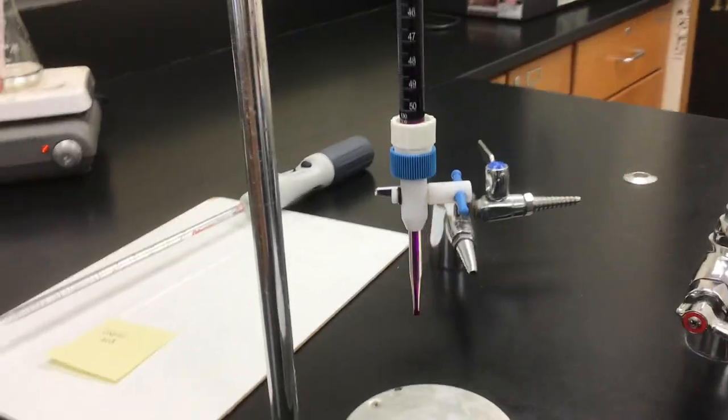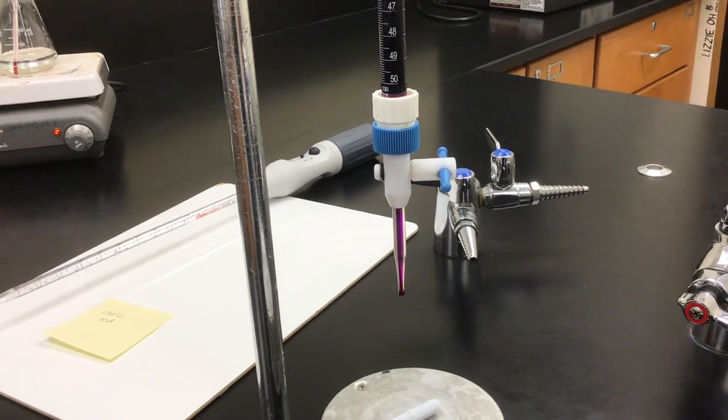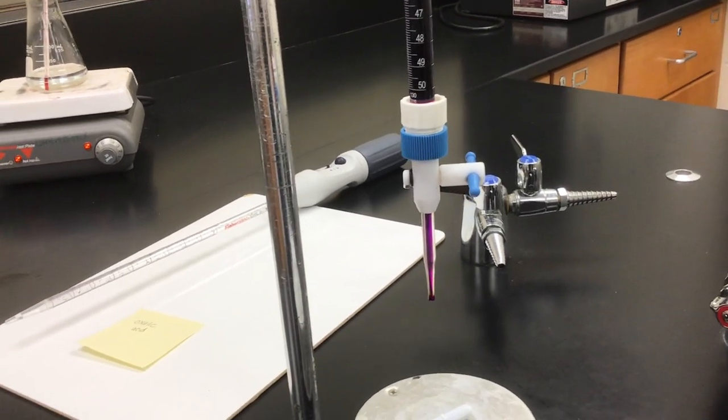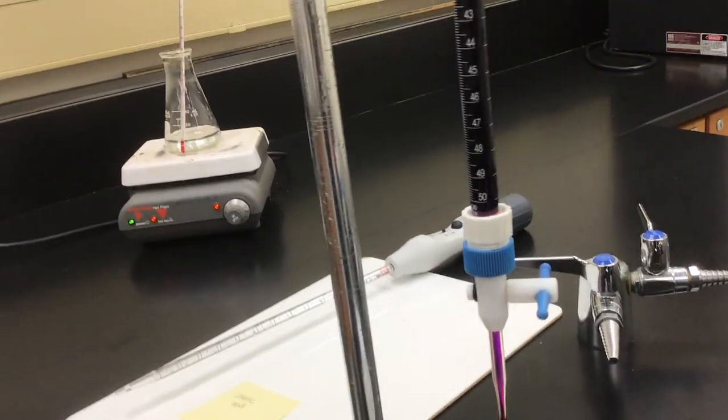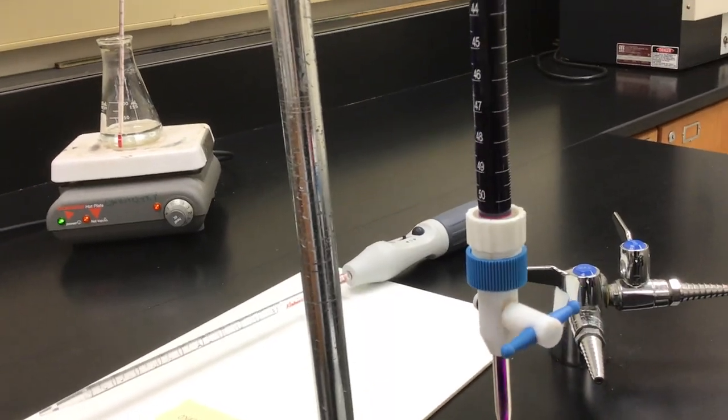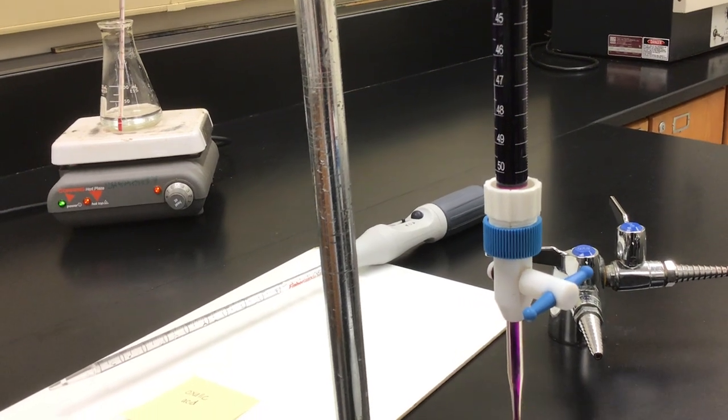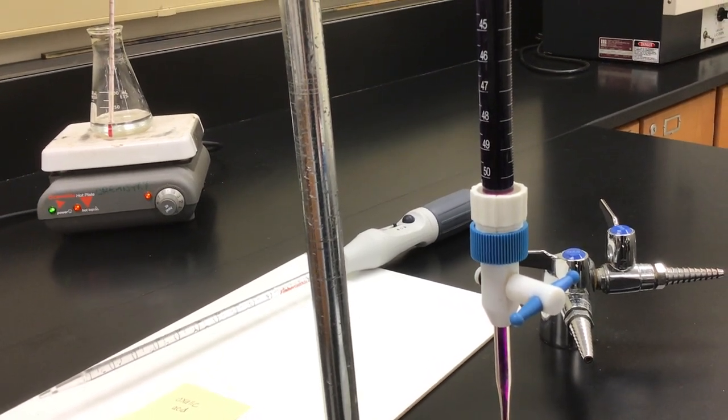Just some reminders that you want when you're titrating. When you're pouring your solution in, you want the stopcock, the valve at the bottom, to be perpendicular to the burette itself. That's when it's closed, so that way the potassium permanganate solution won't drip out of the bottom until you're ready.